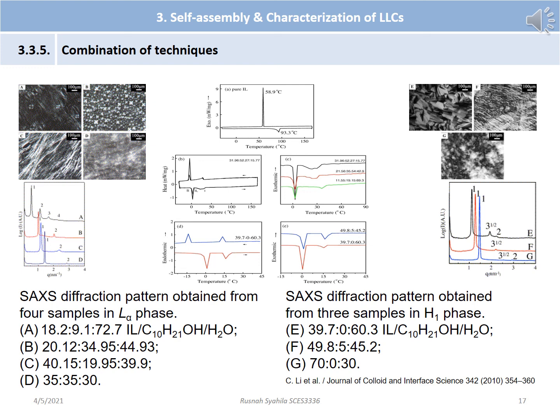Since the F and G microscope images are not clear, findings from the SAXS analysis have concluded the type of phase. The thermogram from the DSC findings does not show the type of phase, but it can tell that there is one liquid crystal phase present. There were 2 transition temperatures observed. The transition temperatures are for the melting point and the clearing point.